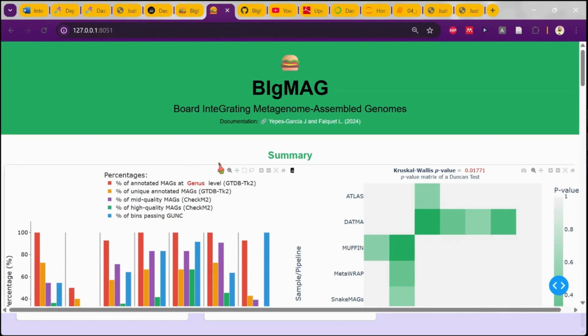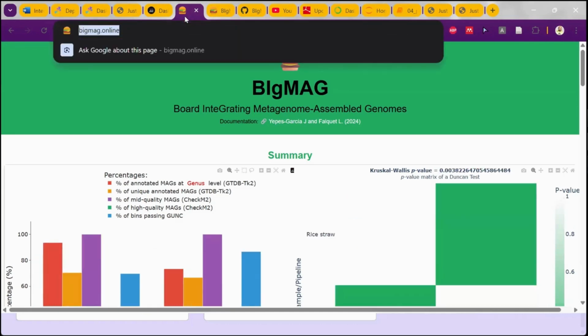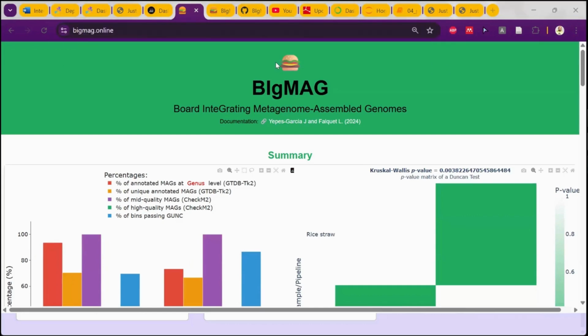But this would mean that each time we render the dashboard, it performs different calculations on different data. Keep that in mind, because it could become a bit heavy and overload your system. So as far as possible, please keep it in a single data frame. Actually, I'm going to share this version that is online for you, that you can access right now. It's a free instance of the dashboard, so it might be a bit slow for you.